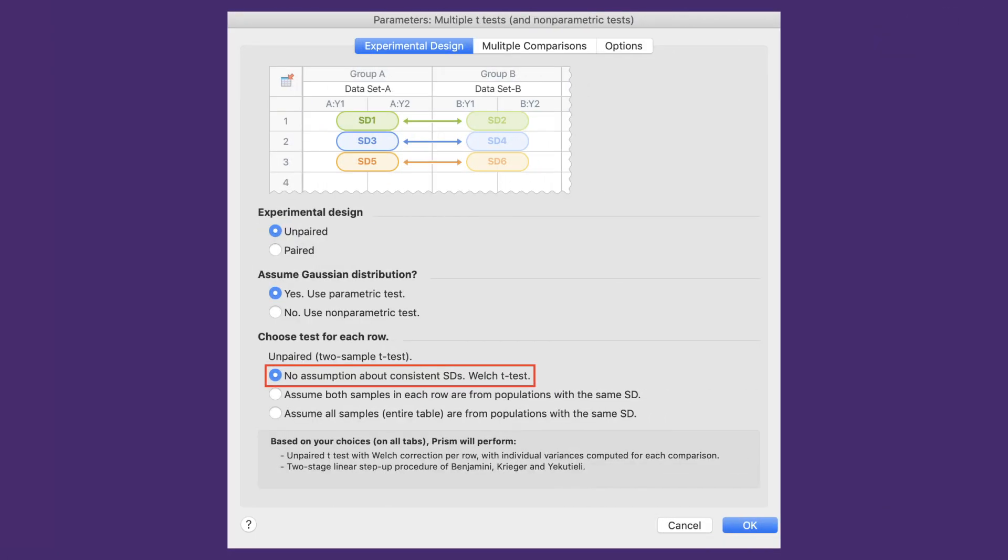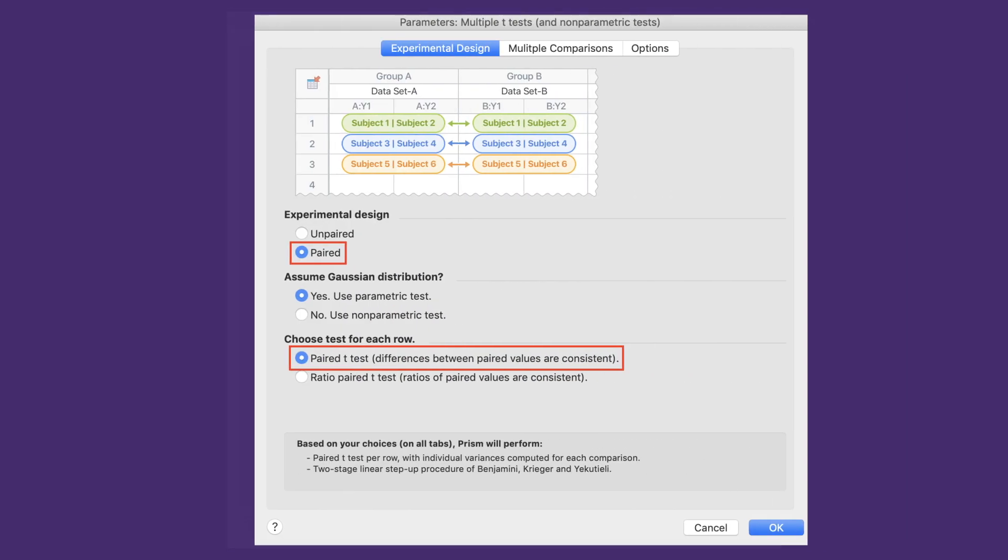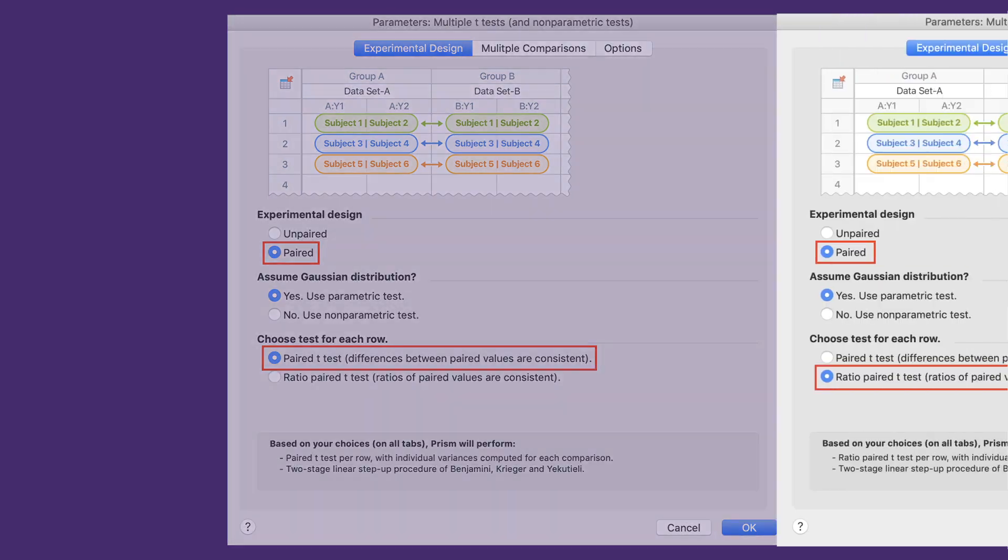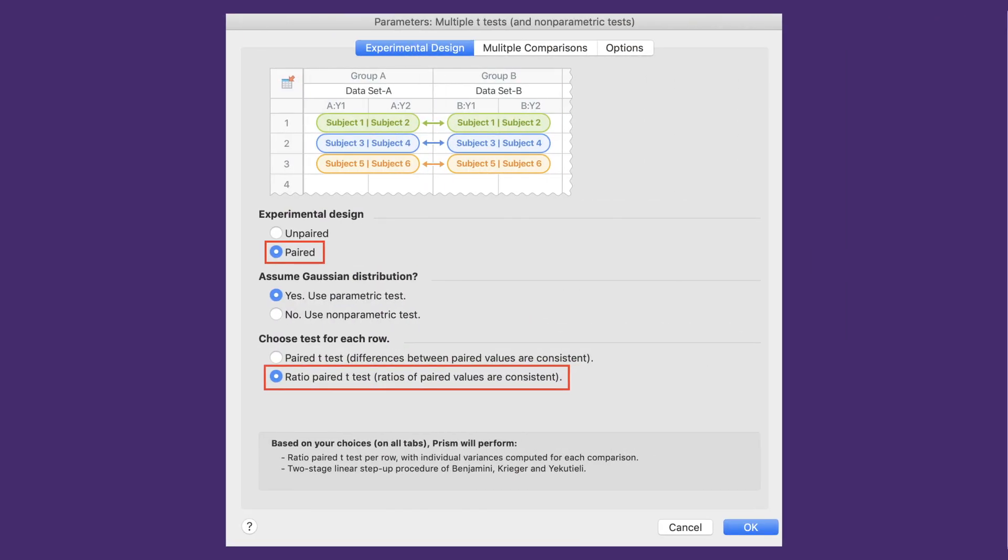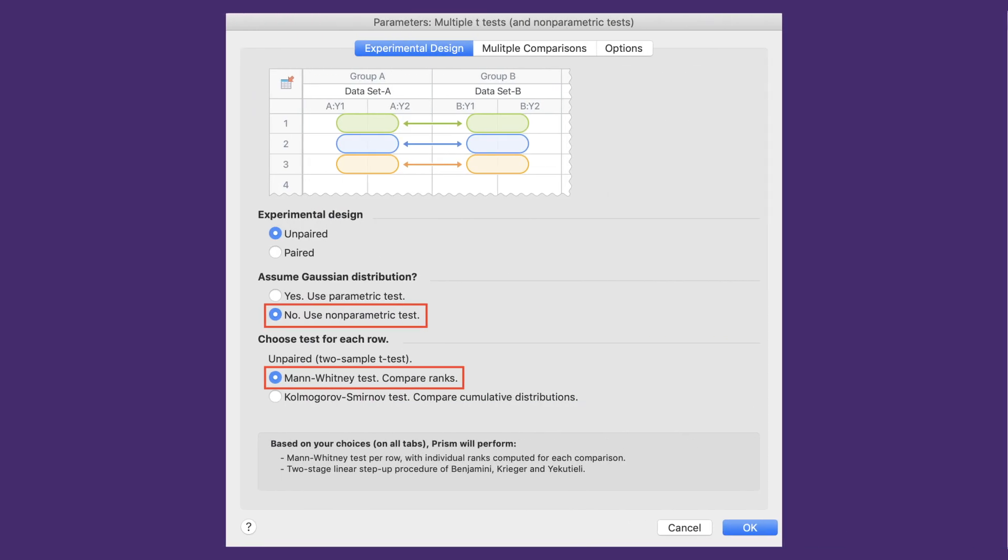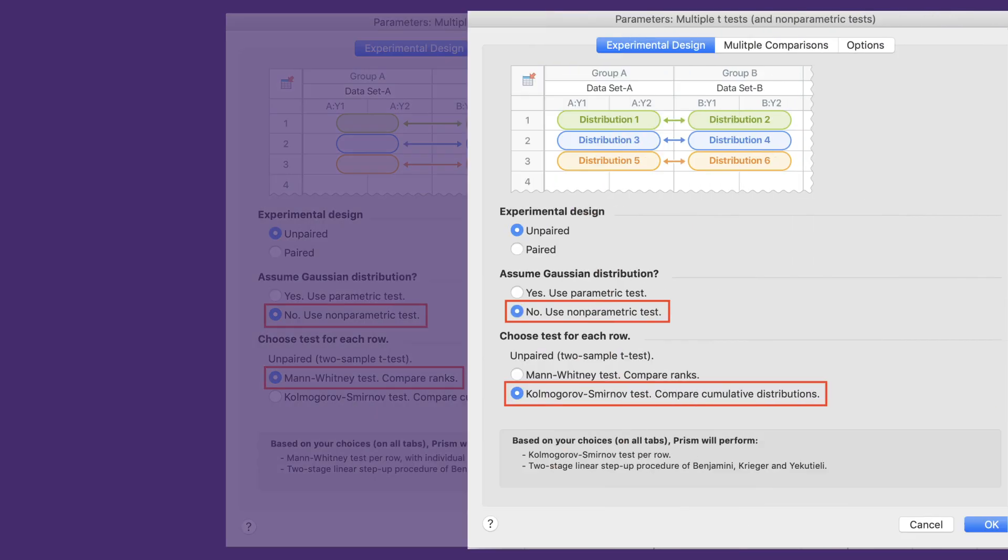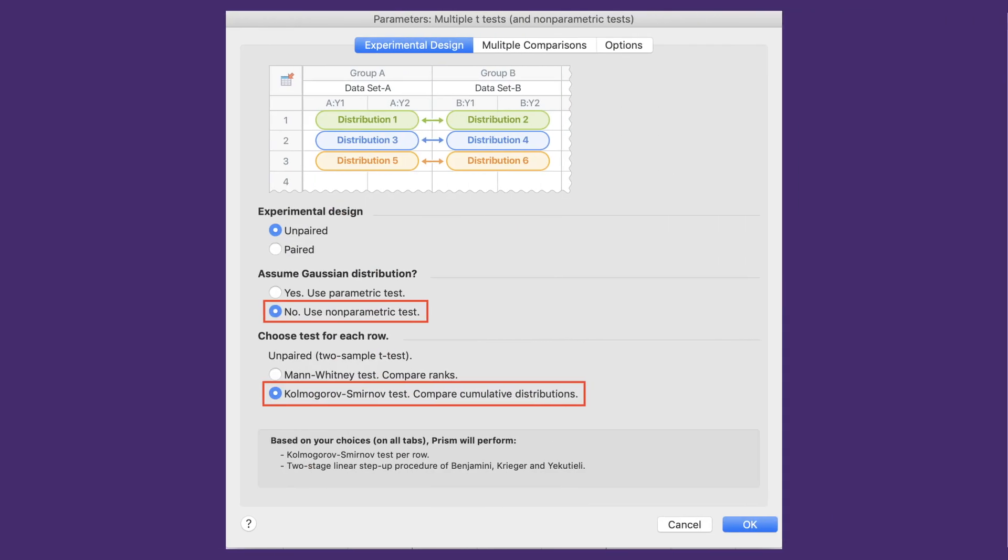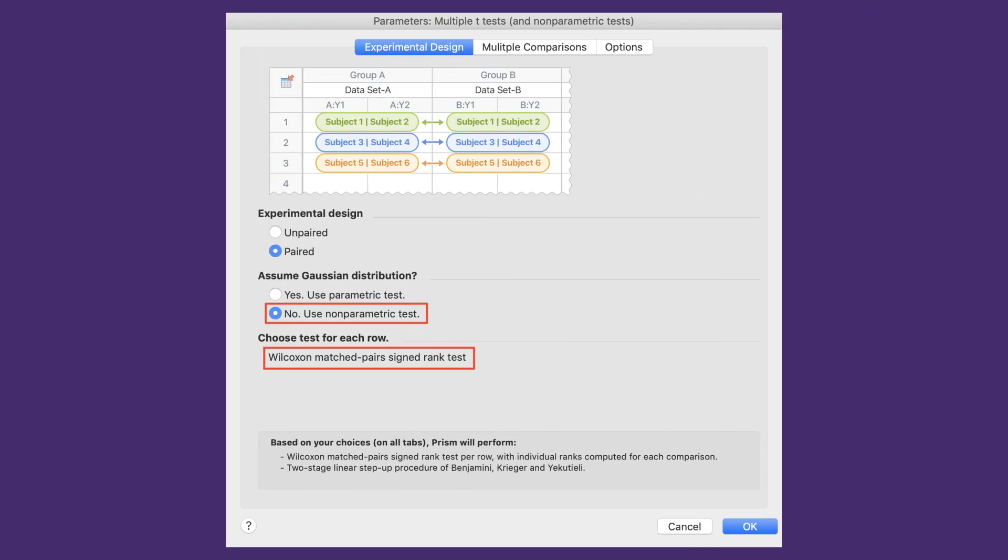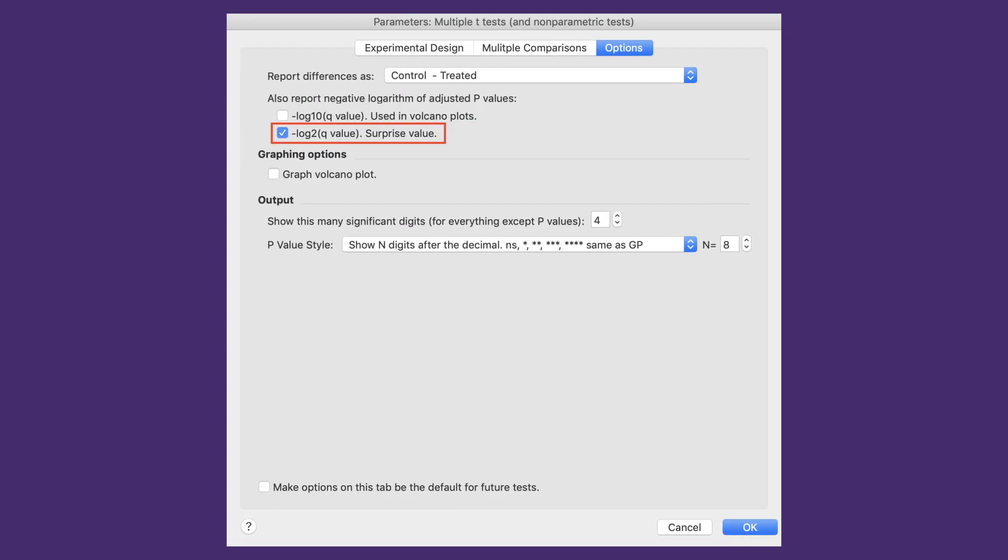The last major feature we'll discuss in version 9 is a major expansion of the multiple t-test procedure, which now includes unpaired t-tests with Welch's correction, paired t-tests, ratio paired t-tests, the nonparametric Mann-Whitney test, the nonparametric Kolmogorov-Smirnov test, the nonparametric Wilcoxon matched pairs signed rank test, and surprise values.